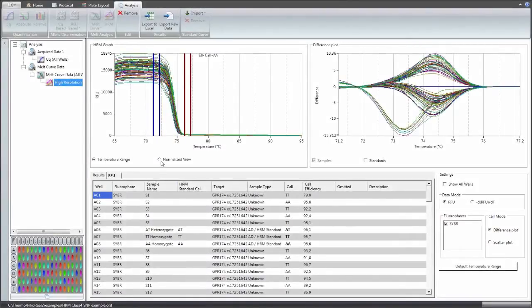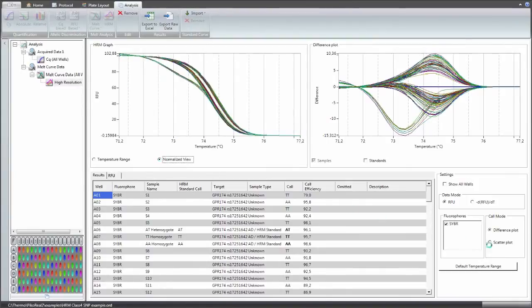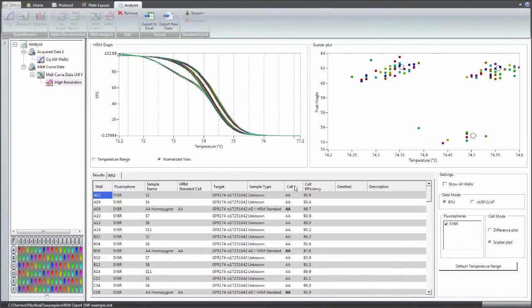Also, the individual analysis modules contain user-friendly and visual features, like the scatterplot view in high-resolution melt analysis, which helps to quickly interpret the results.